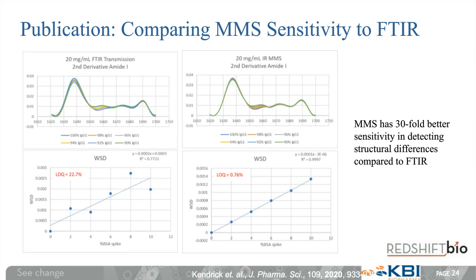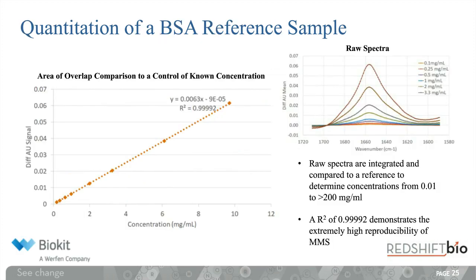Now, coming back to our study. One of the BSA samples, which has proven to perform okay in our assay, was selected as reference and scanned at different concentrations in order to study the concentration effect on sample structure. Then, the obtained equation was employed to determine BSA concentration for the rest of the samples.